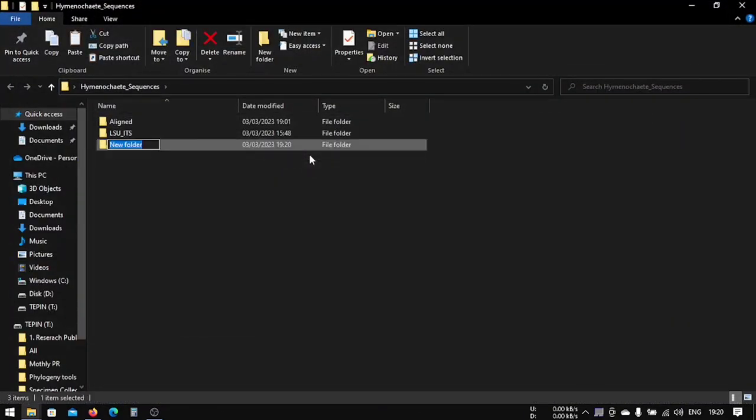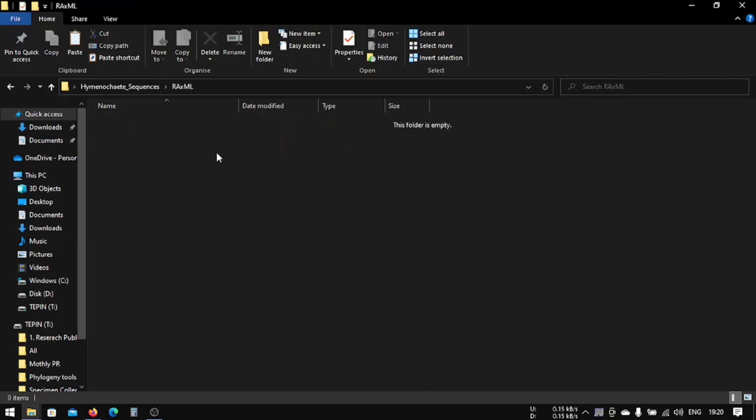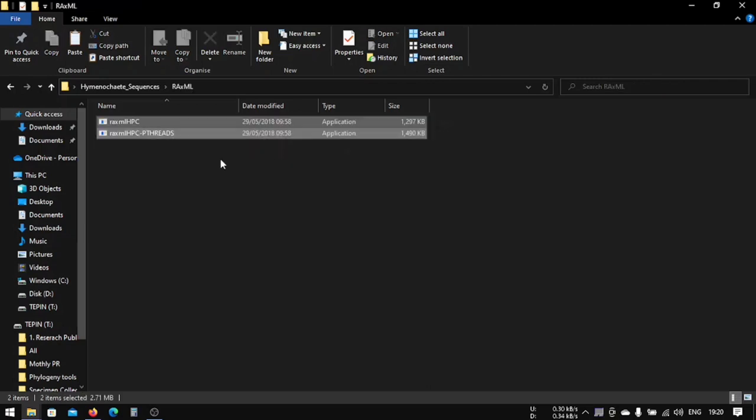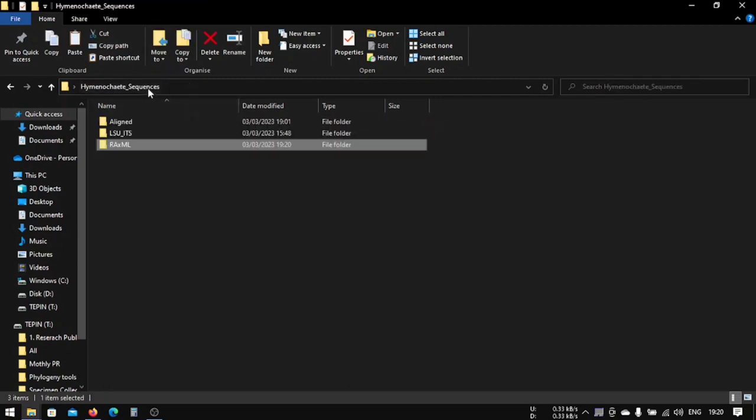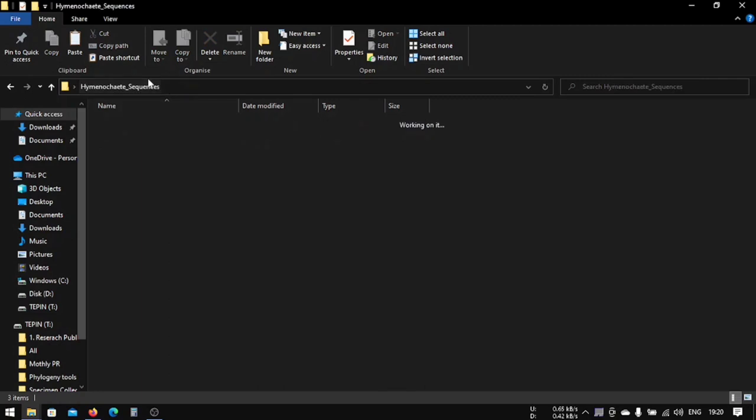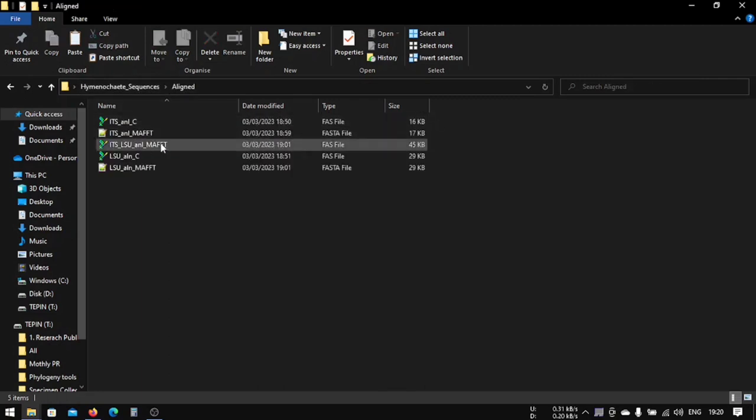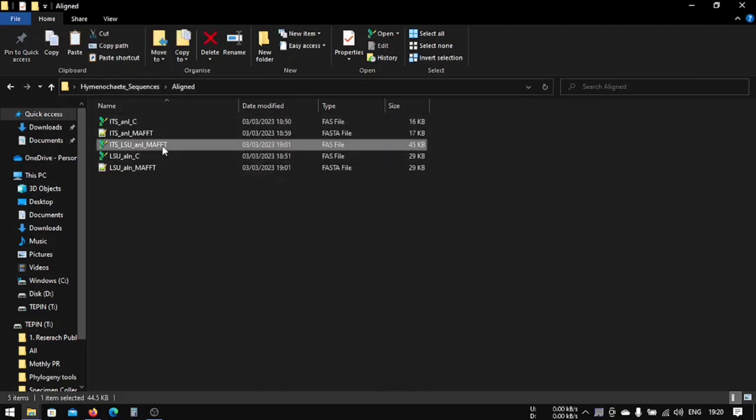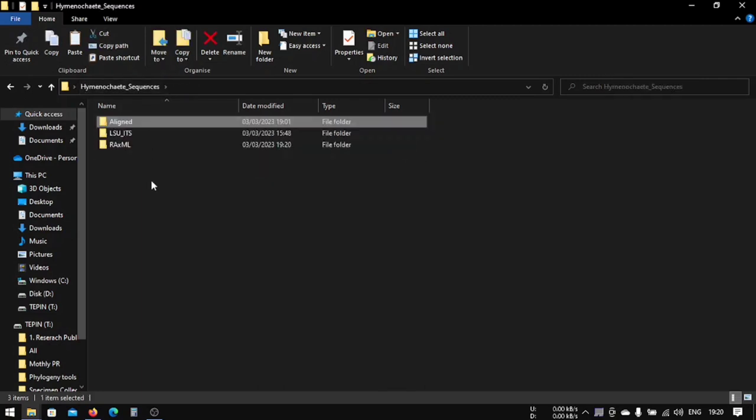We're going to make another folder called RAxML. In here we are going to paste the two files that we have copied from RAxML. Then, after this, we are going to use our align file here. Copy it and just keep it here for now.